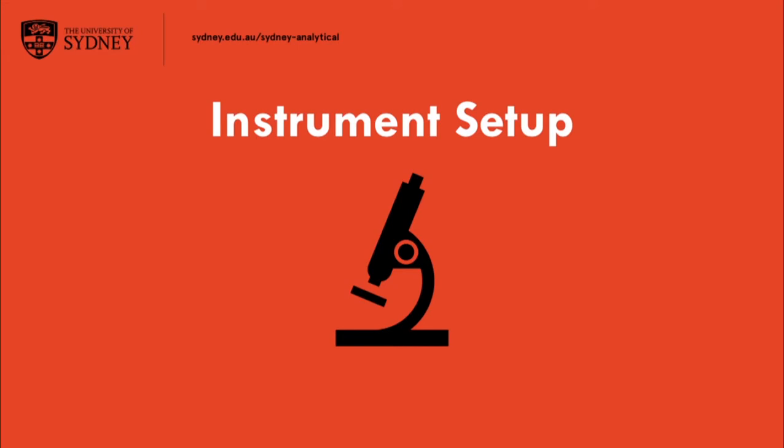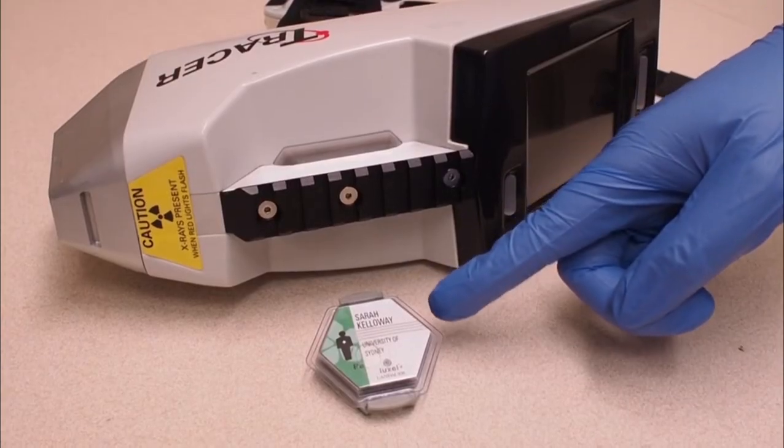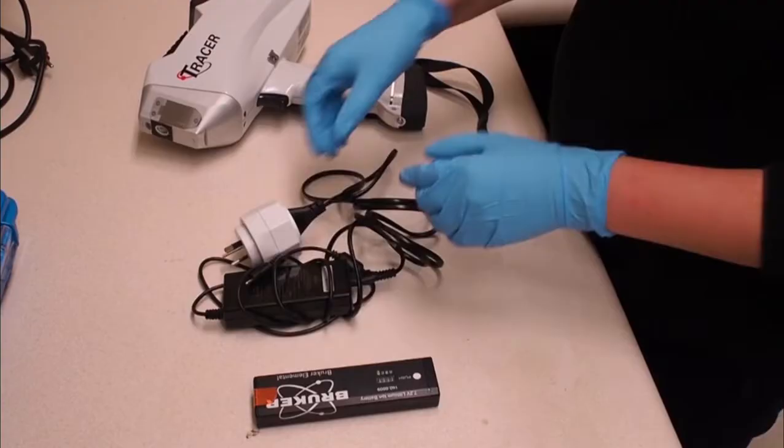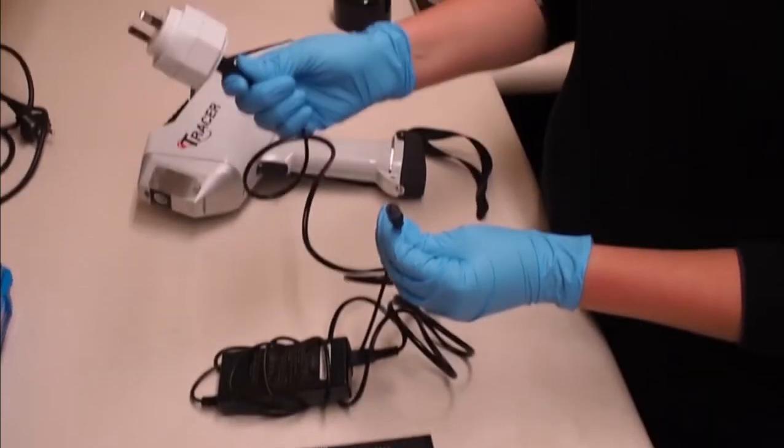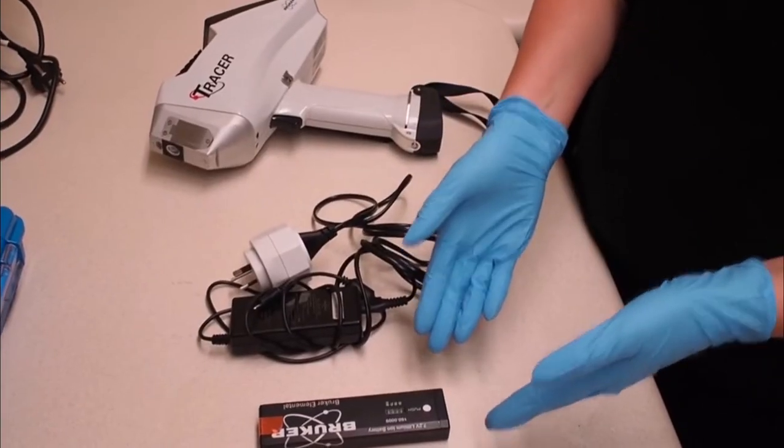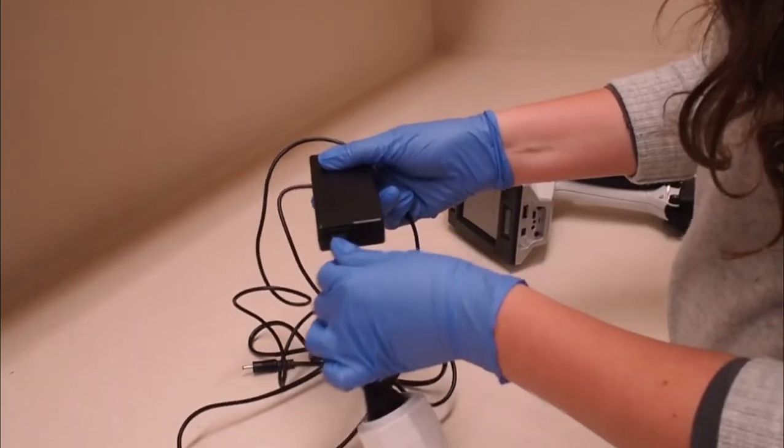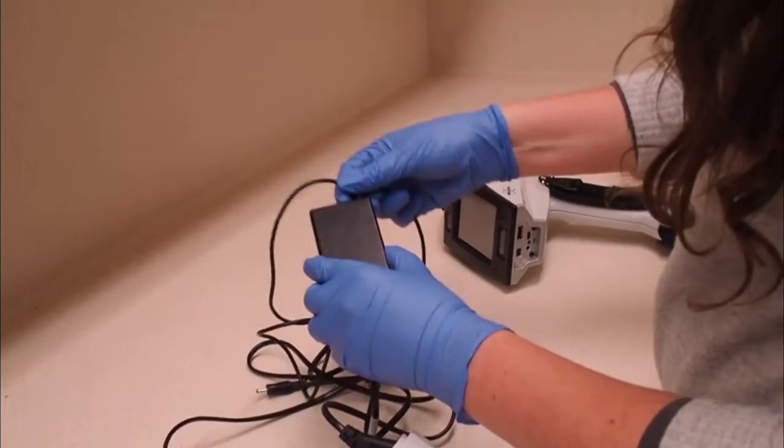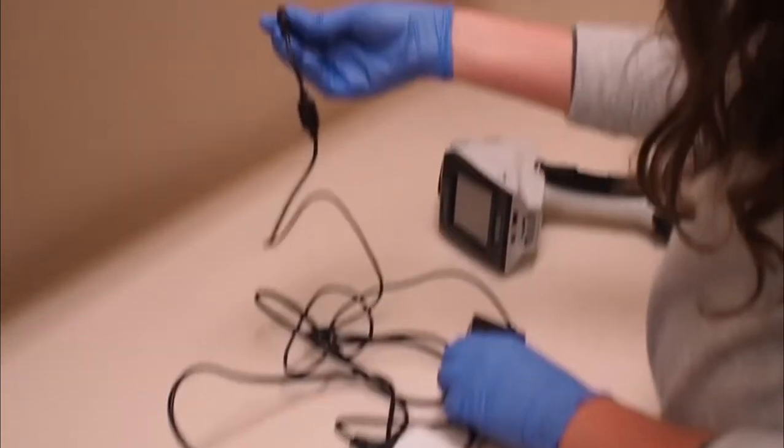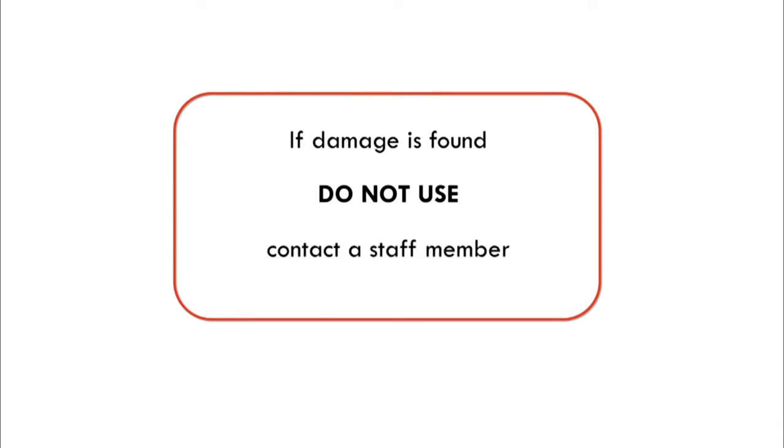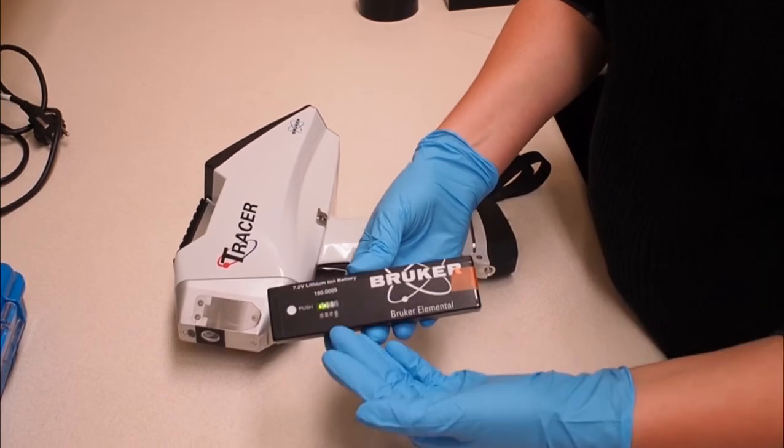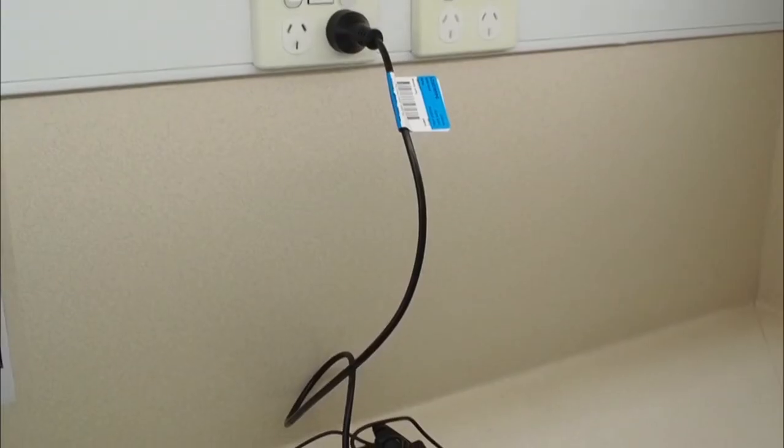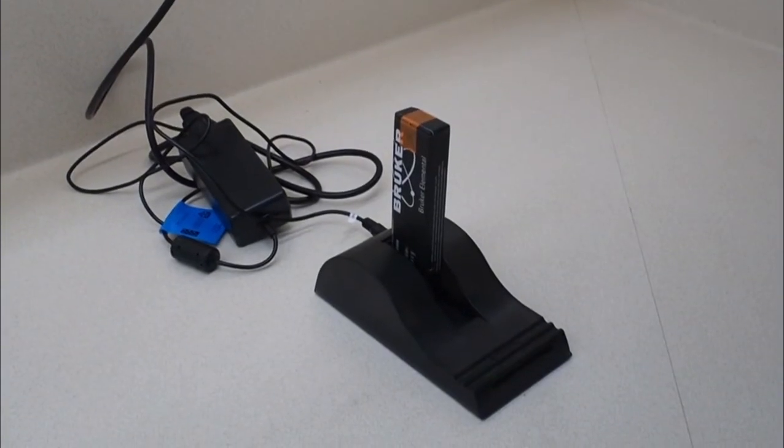Instrument setup. Ensure you are wearing a dosimeter and the correct personal protective clothing. The tracer can be powered off main power or battery operated. Check the power leads, cables, batteries and instrument housing for damage or signs of wear. If there is any doubt, do not use the instrument and contact a Sydney analytical staff member. Check the charge on the batteries by pushing on the side. When you have finished using the instrument, please return the batteries fully charged.